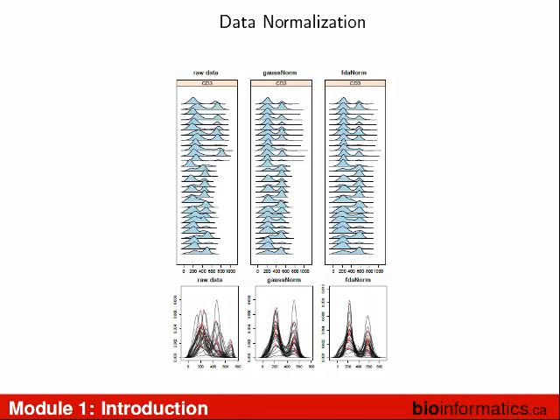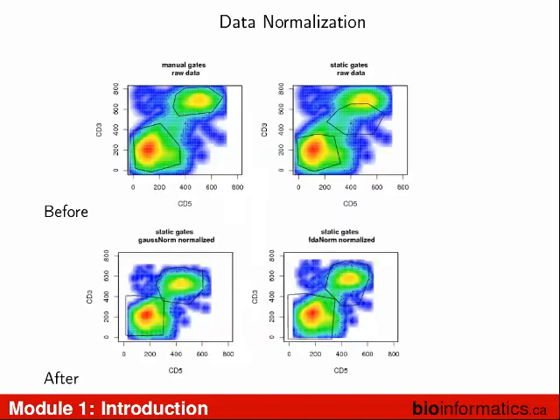So this is before. It's just a mishmash of all these populations. This one's all the same. But we know that there's two kinds of things going on here, and so it goes whoop. It's all good. And the cool thing is this works really well. So this is using FlowJo. So here was with the manual gates.